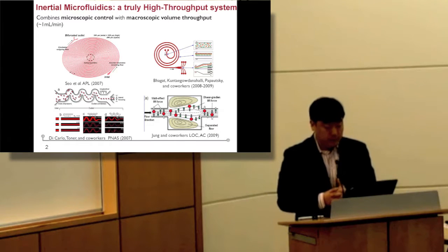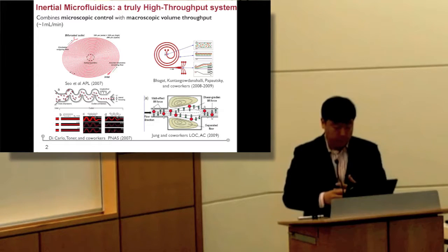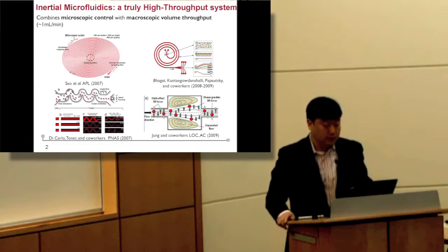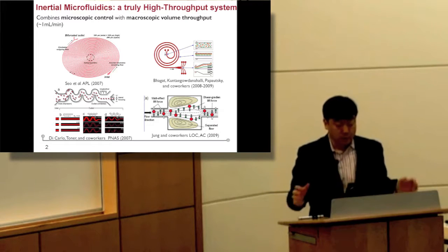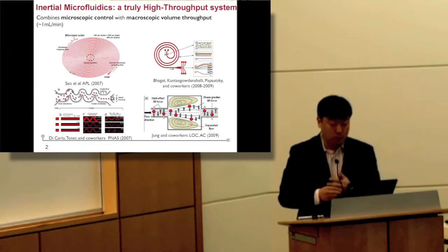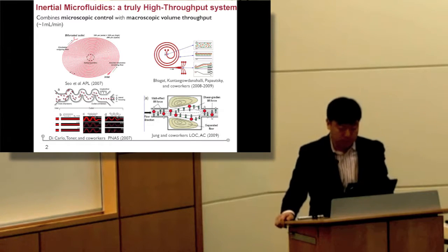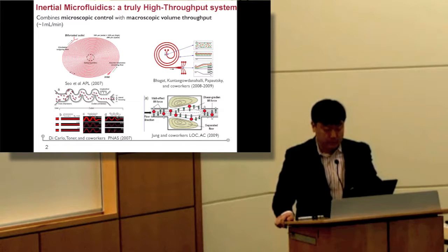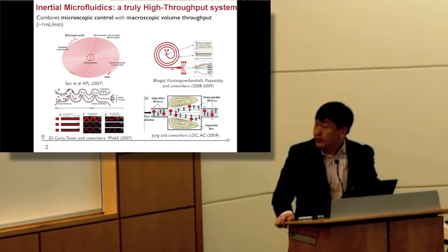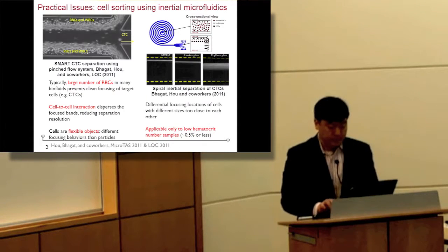There has been a very exciting development in the area of microfluidics, which is the new concept of inertial microfluidics. And this is very innovative because it combines the microscopic control that enables very good separation with macroscopic volume throughput. And I think Professor Toner's group at Harvard and many others pioneered this area and it is still in the early stages of development.